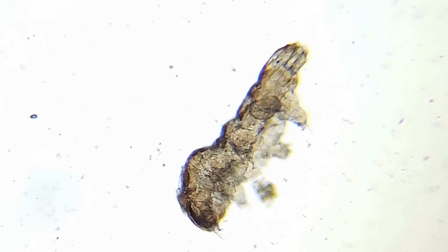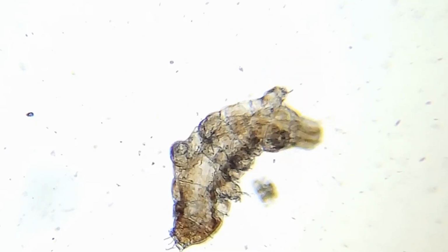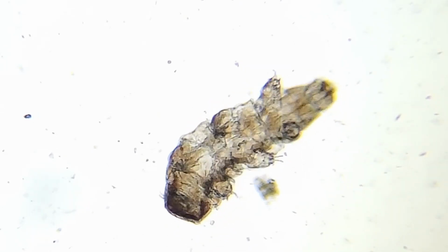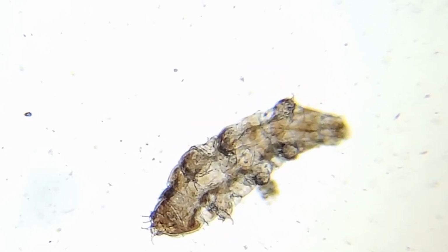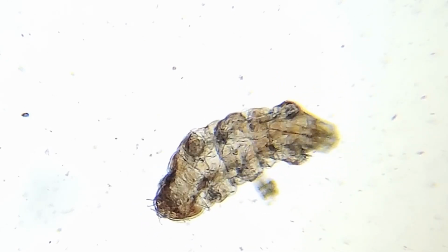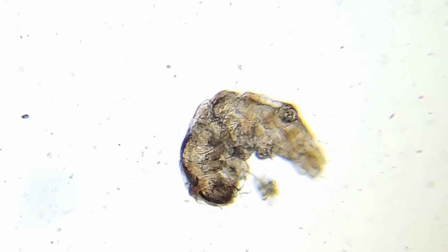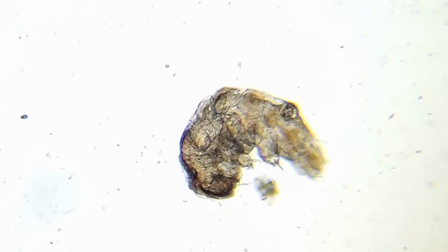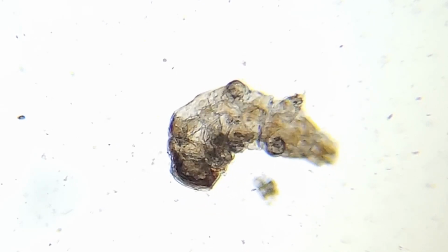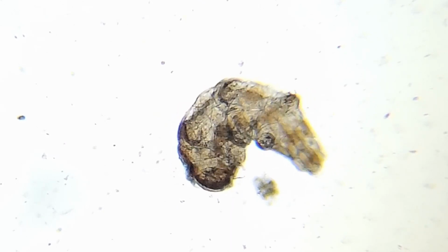Swimming around, that little, probably a little protozoa or something. He's cute. I'm actually just using my old phone to capture the video input, the visuals that are coming from the microscope here. I'm using it as a screen, but also for the video capture. That way I'm capturing this in 4K with this phone, and I can lay the video from my old phone over top of the video on this phone that I'm recording right here.